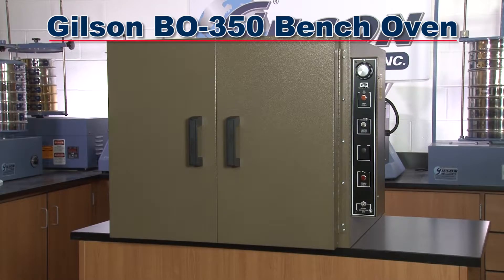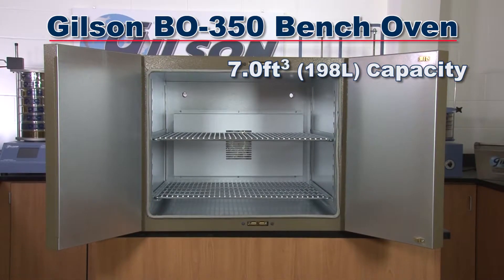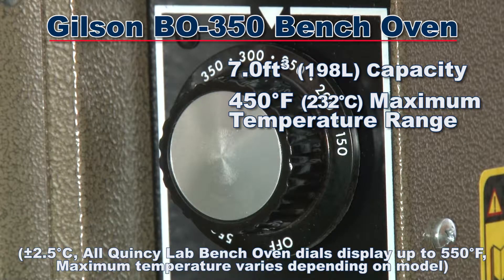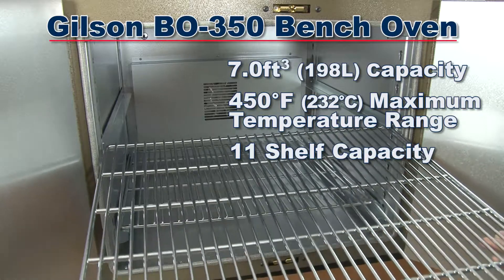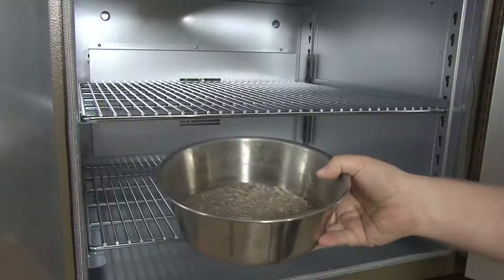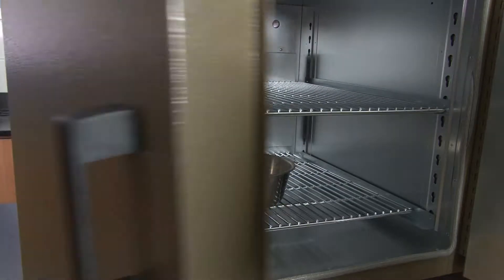The Gilson VO350 Bench Oven has a 7 cubic foot capacity and a 450 degree Fahrenheit maximum temperature range. This rugged unit can accommodate 11 shelves, with each shelf having an 80-pound load weight capacity for your specific drying and controlled heating applications.